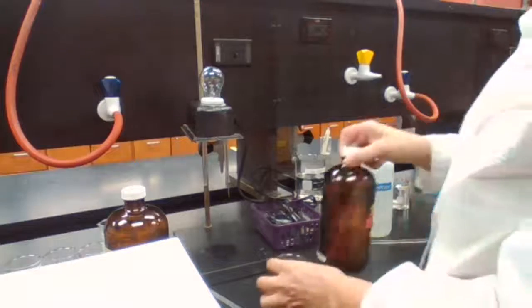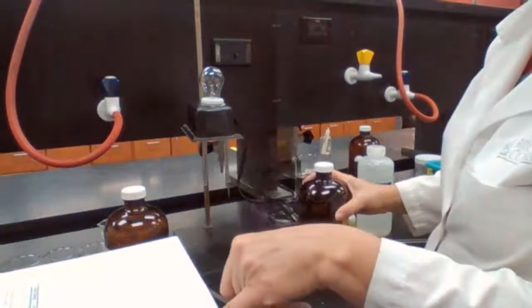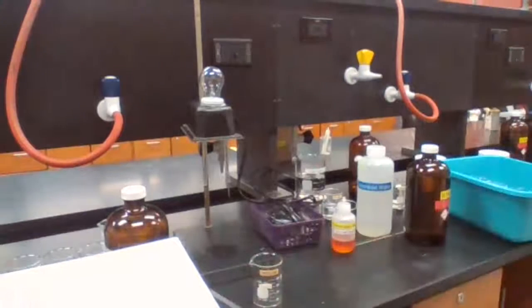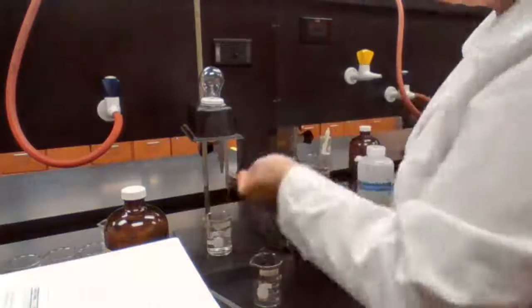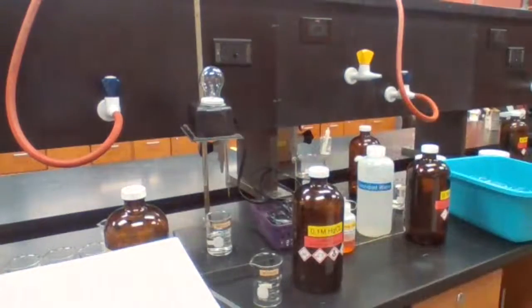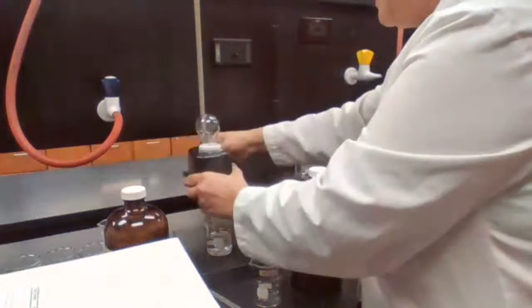Next one on the list is mercury 2 chloride. All chlorides are soluble except for mercury, silver and lead.